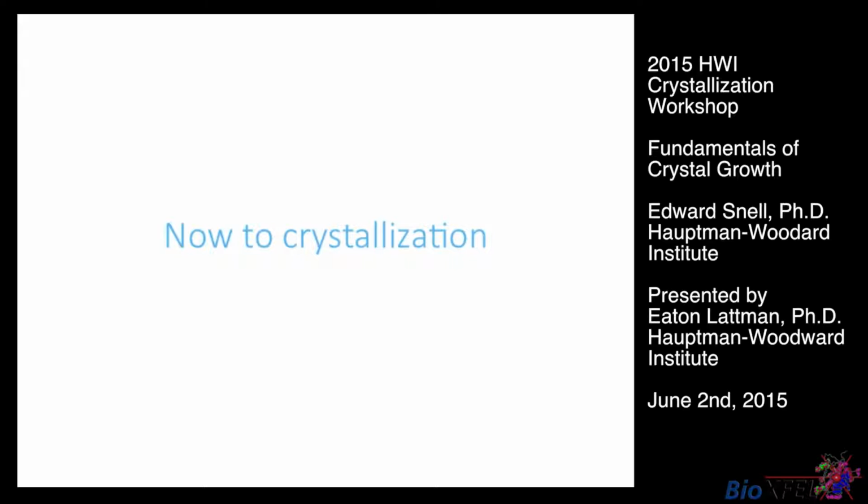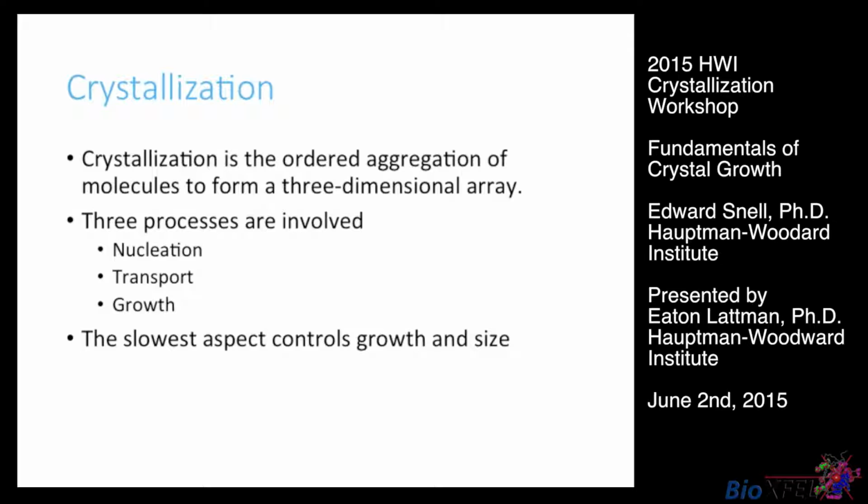Right, now on to crystallization. Remember, all this was preparation of the wonderful tools we have for crystallization and why it's important to have crystals, and now we're going to see how we do it.